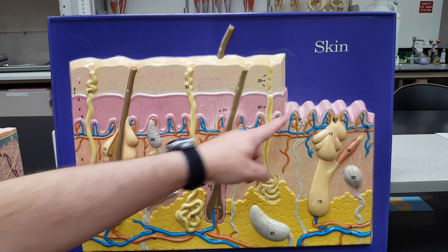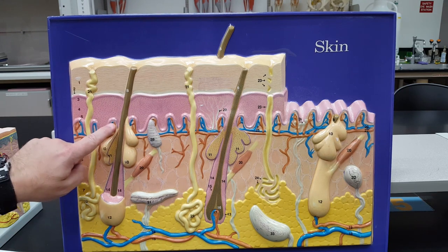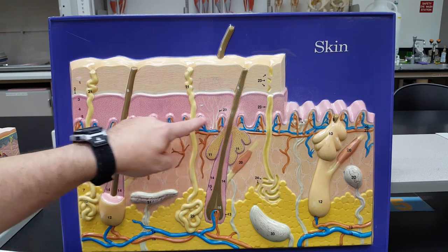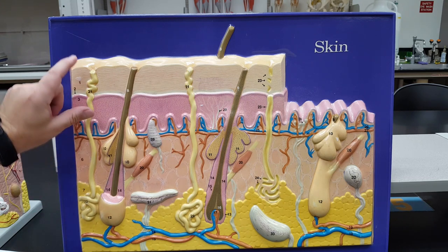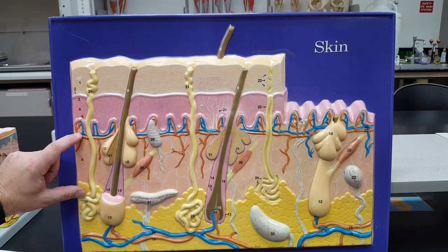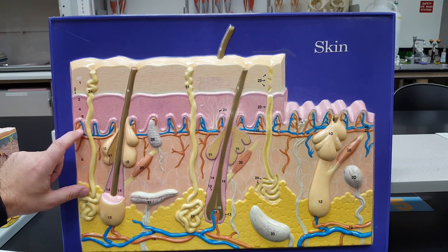I can tell where the epidermis starts because I see these little hills, which are papillae. A papilla, a single hill, like right here, that's a common term in anatomy describing anything that's a small little hill. Technically, it's anything that is nipple-shaped is a papilla. So I can see all these papillae here, plural. So they mark the boundary between the dermis and the epidermis. So epidermis, and then below that, the dermis. These are the two primary layers of your skin.